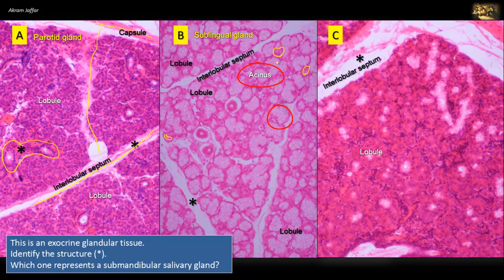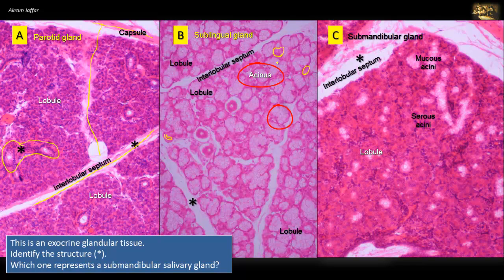In addition, in the mucous acini, the nucleus is flattened toward the base, while the nuclei of the serous acini are rounded. C represents the submandibular gland. It consists of a mixture of serous and mucous secretory units. The serous units are darkly stained and the mucous units are more lightly stained.